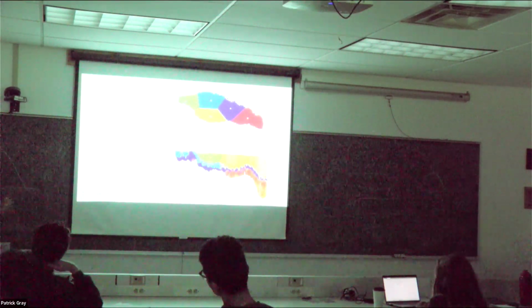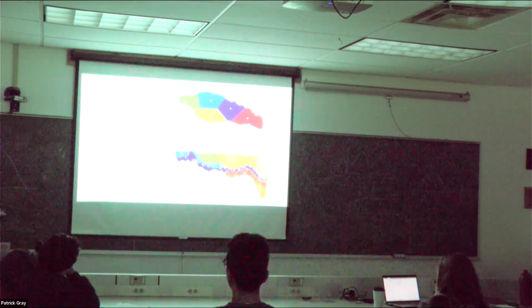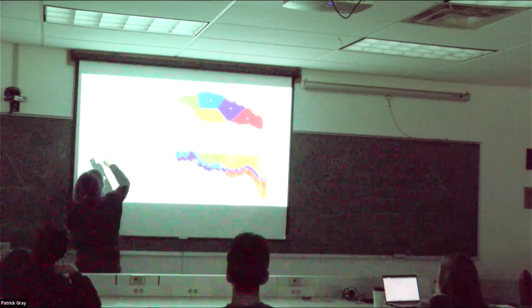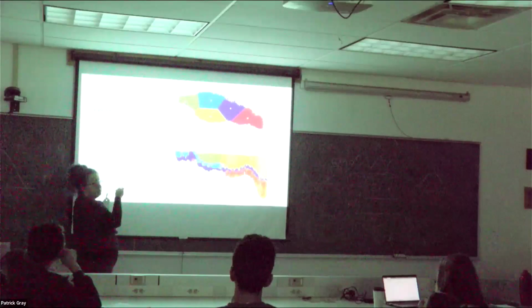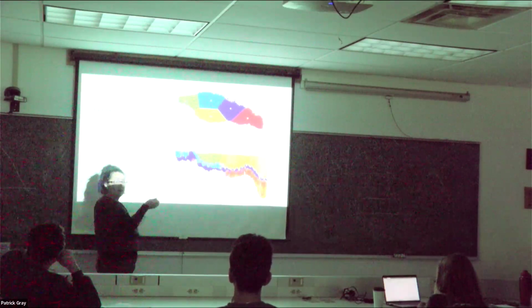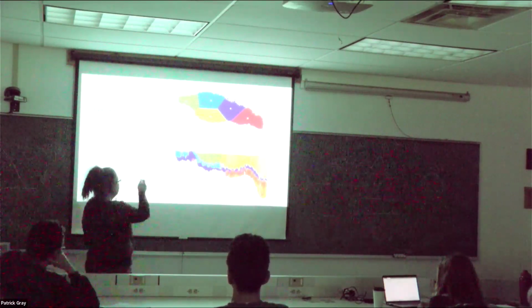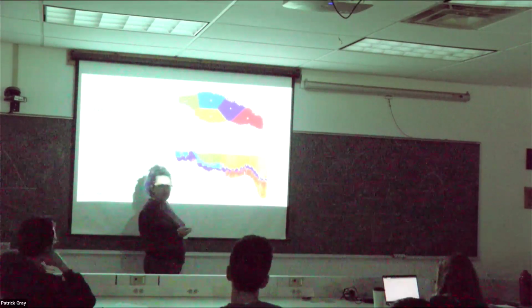So this is a really cool paper. I did something similar during my PhD, but this one has machine learning, so it's better. This paper just got published, and they used single excitation emission CDOM fluorometry, and they have it in micrograms per liter. Maybe they did some kind of conversion; usually it's quinine sulfate in acid, and we use parts per billion. Versus salinity, they did some kind of clustering to determine different water masses.